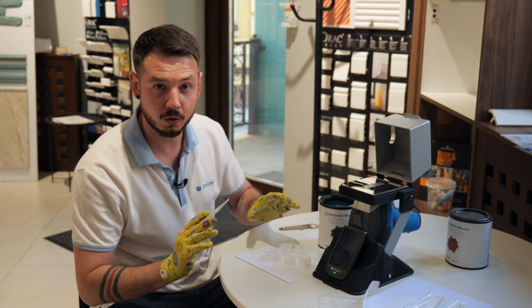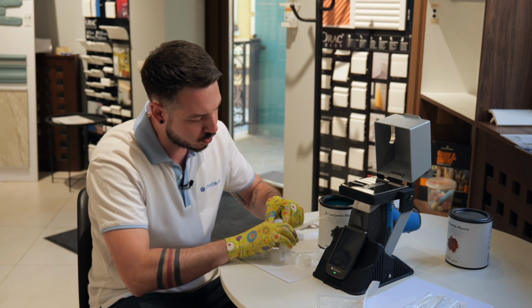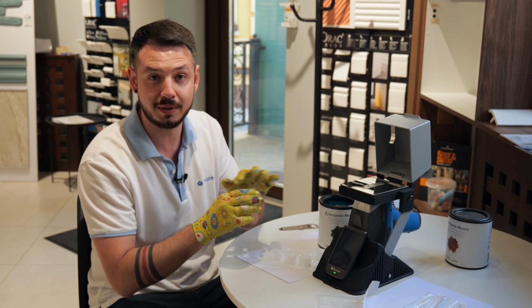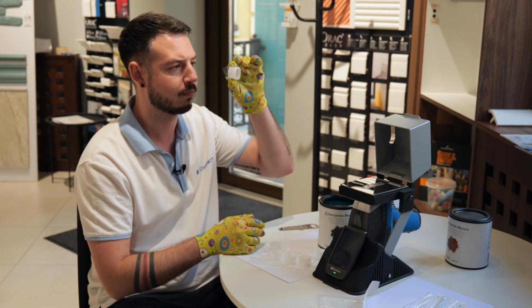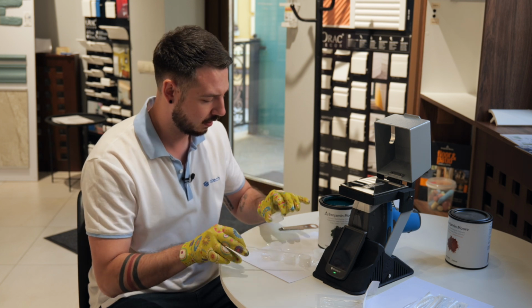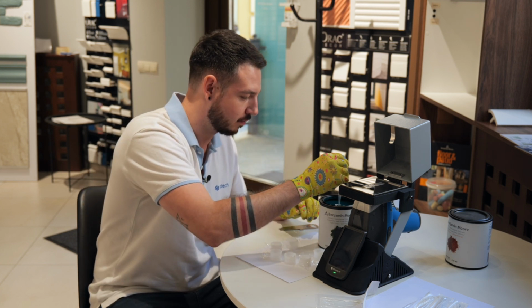Before you pour any liquid into the cup, you need to make sure that the special film is positioned correctly and that no liquid will pour out of the sample cup. We have this one pretty tight and clean. Now we can pour some paint in it.